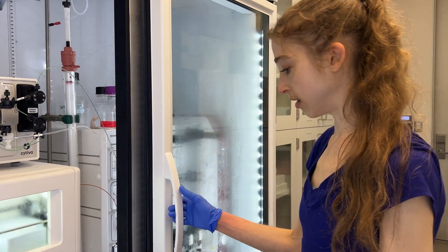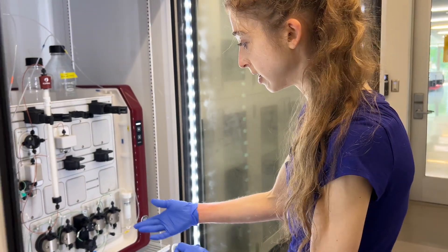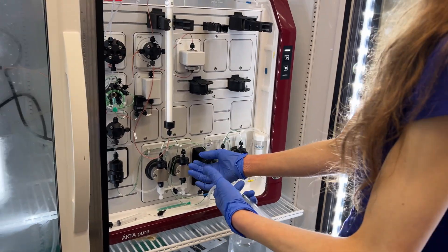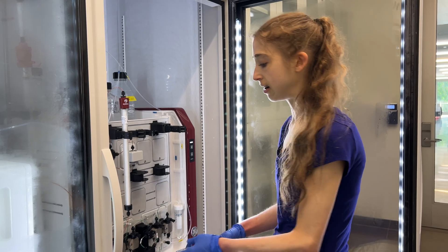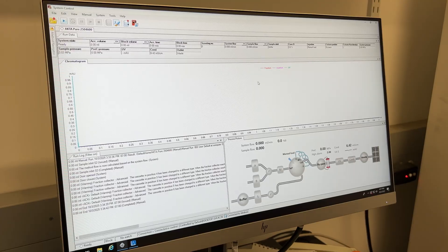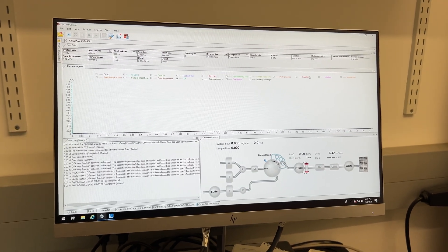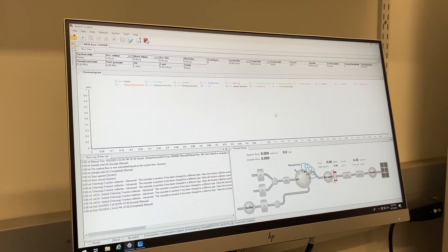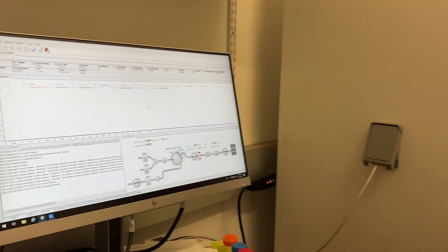Those are a couple of general maintenance things for using your ACTA — it's a more frequent task, like after every run or before your runs, you'll be priming your pumps, also called purging the air out. It's really important to prevent air from being in the system, as air can damage the system. You can also right-click on your screen, go to filter curves, and click on system pressure to monitor the pressure — you might see unusual readings there if there is air in the system.